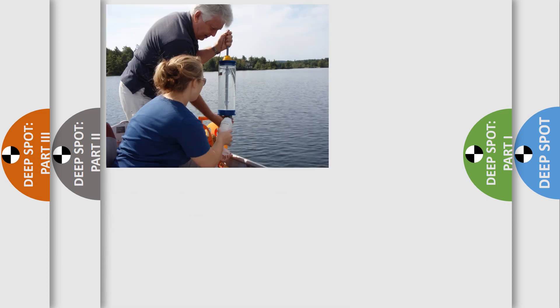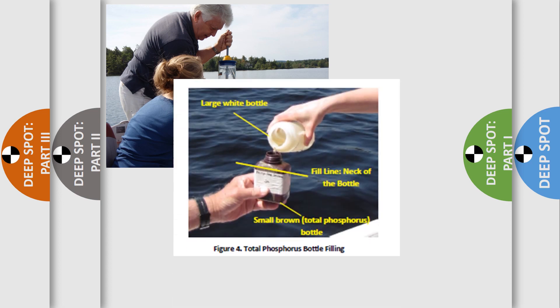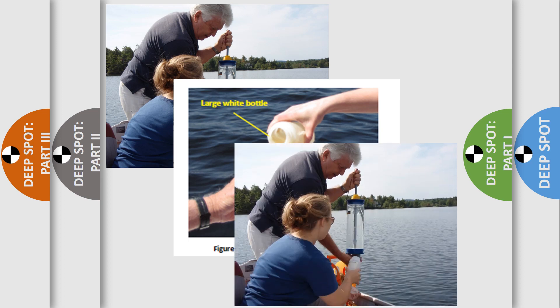Take your large white bottle and fill it with a small amount of water. Rinse the bottle and discard the water, then fill the white bottle up. Next, pour water from the white bottle into the small brown bottle. Do not rinse this bottle — it contains a small amount of acid as a preservative. Watch carefully as you fill and only fill the brown bottle to the shoulder. Finally, top off your white bottle with water before you dump the Kemmerer bottle.